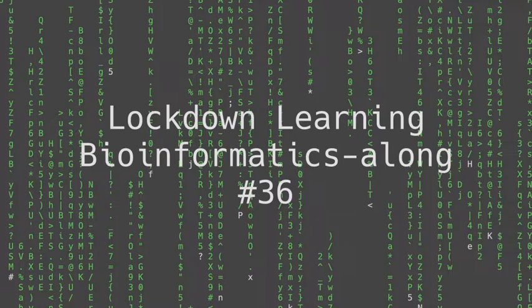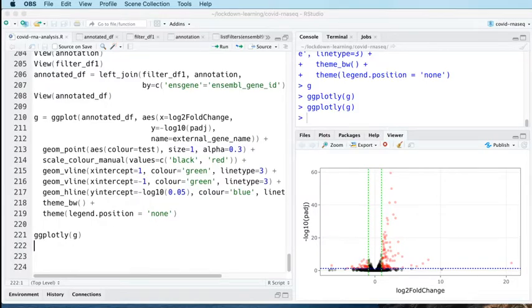The Ensembl gene IDs are not very human readable. They're very useful, as we found yesterday, for mapping to other data sets, but they're not massively useful if we want to be able to see what the genes are. And so that's where we're at. We've got our volcano plot. This is our interactive volcano plot here, and we get an idea of what the genes are by hovering over the points, and we get the gene names popping up in our little viewer.